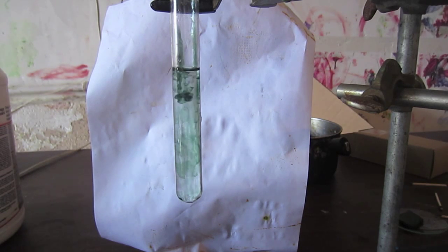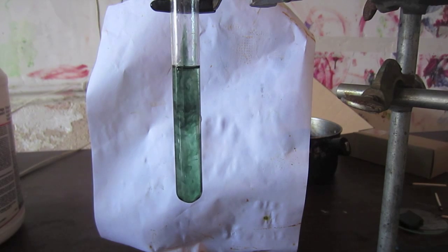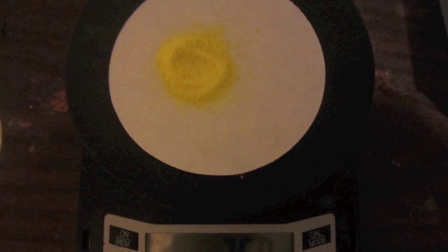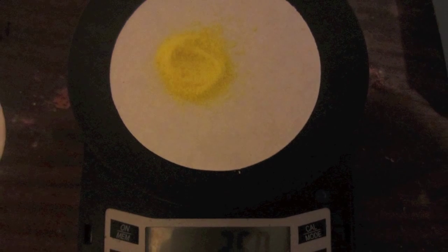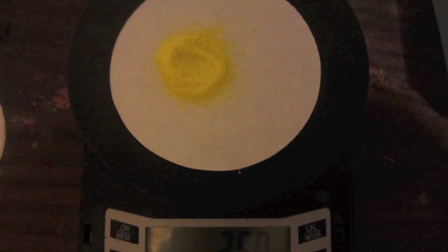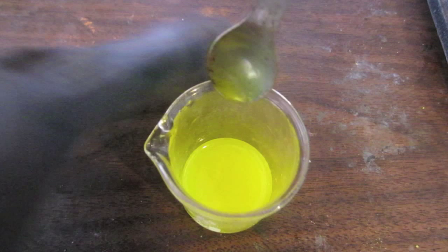Other than plus three, the next most common oxidation state of chromium is plus six. Chromium plus six is a nice yellow color. Here is potassium chromate, a salt featuring chromium in the plus six oxidation state. Here it is dissolved in water. So really nice yellow.